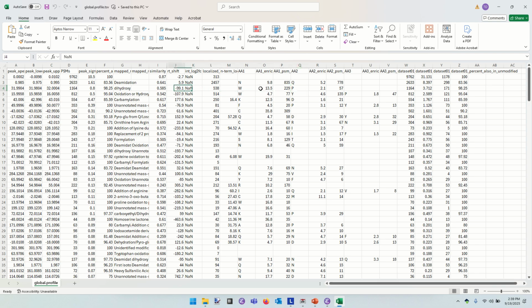Okay, we move on to the next one, single oxidation. All right, so we know that oxidation happens to methionine, right? But hold on a second, what's going on here? Single oxidation was most overrepresented in tryptophan. So tryptophan's playing this sneaky trick on us that it might be doubly oxidized or it might be singly oxidized. Who knows? It may feel that way today and a different way tomorrow.